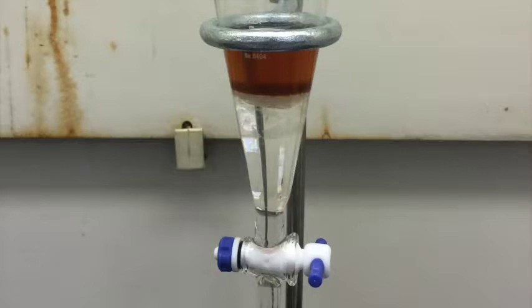And that layer was then mixed with chloroform, and put into a separatory funnel, and we have 2 layers. If we had taken that aqueous layer and mixed it with methanol, ethanol, acetone, we would not have 2 layers, and we couldn't do this extraction.